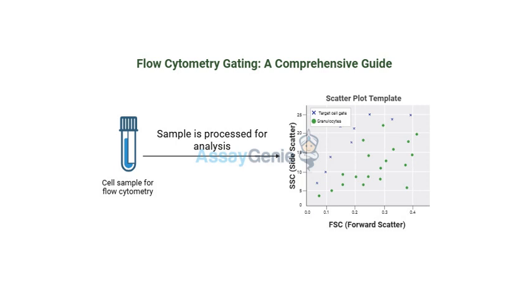And then once we have those compensation values, we use them on our actual experimental data to correct for the spillover, and that gives us a really clear and accurate picture. So compensation is super important then, right? Especially when you're doing these complicated experiments with lots of colors. Absolutely. It's all about making sure our data is good and that we're drawing the right conclusions from our cellular investigation.